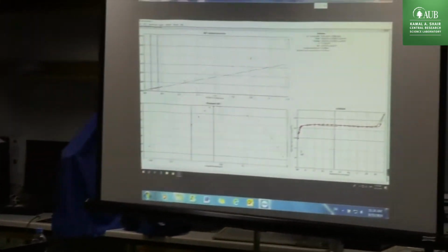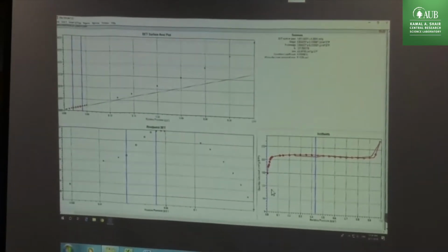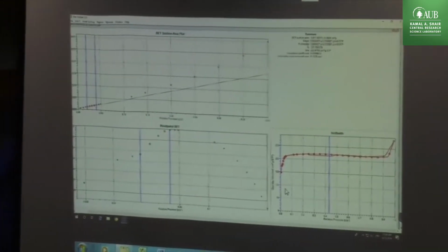The second thing is that we have seen many of our customers, I would say maybe 85%, don't use very pure or high purity gas, especially for the free space with helium. They can have some oxygen, because when you go from 99.99 to 99.995, you pay 3 times more. So it gets very expensive. In some places, they cannot afford this.